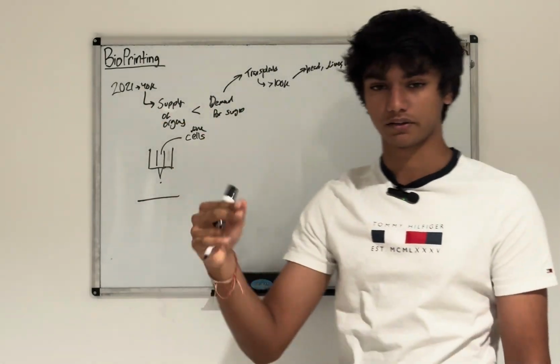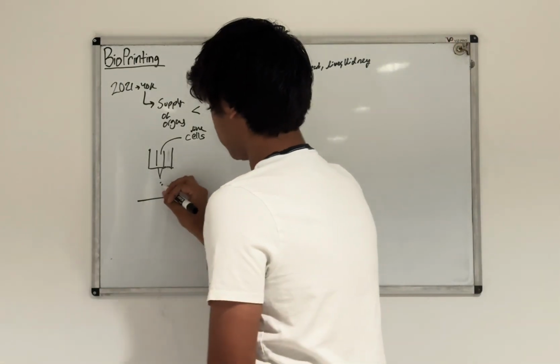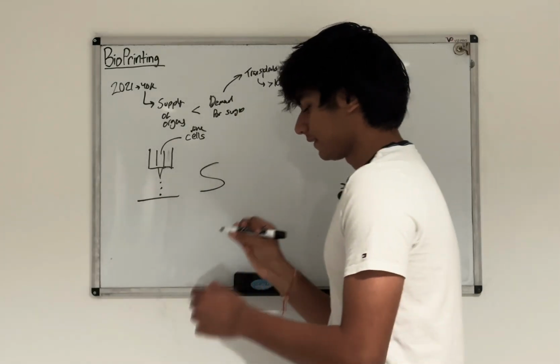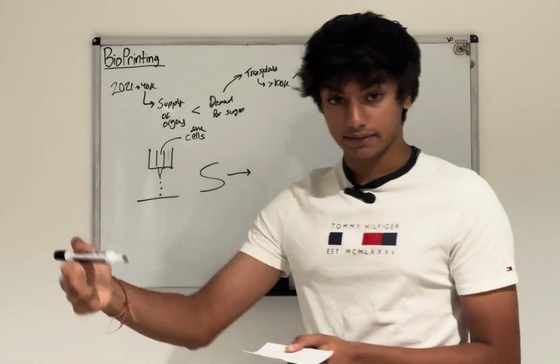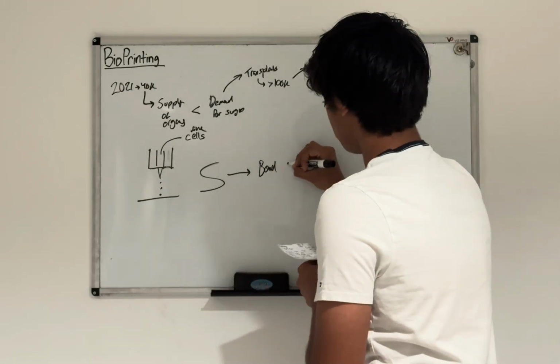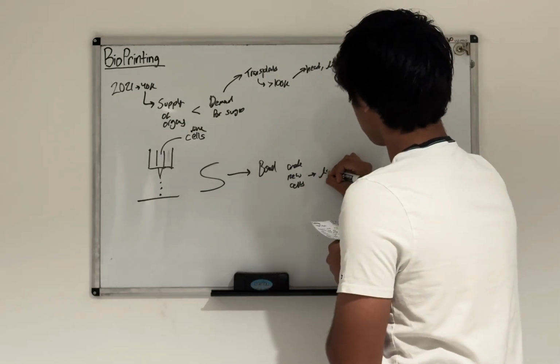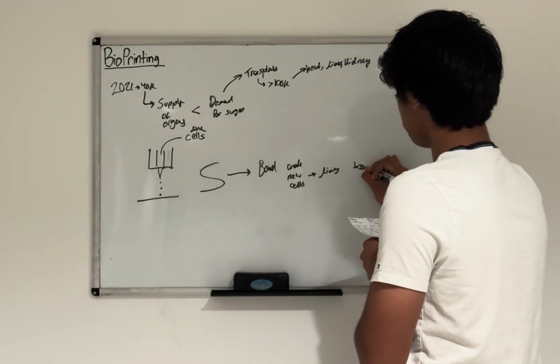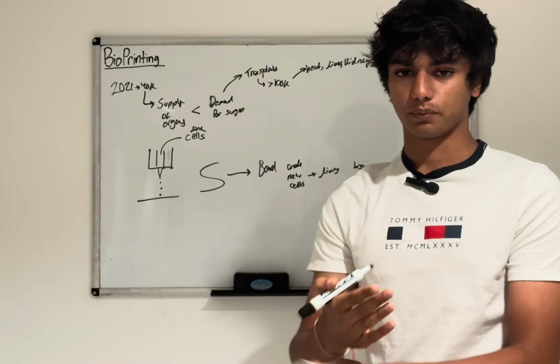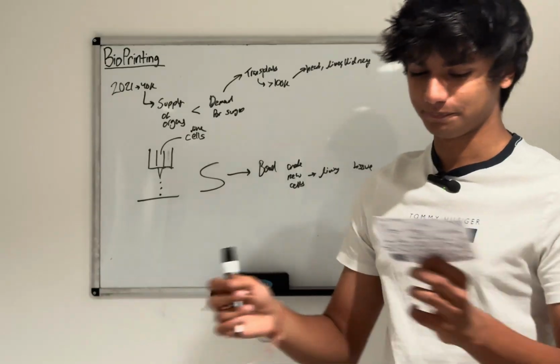How the inkjet printer works is it sends blobs of ink on a platform. They sent these blobs and made a basic little structure. Then these cells did what they naturally do. They were able to bond, mutate, and create new cells, and eventually this created living tissue. So this first type of bioprinting worked by sending blobs of live cells, and eventually these cells would do what cells normally do, combine, create new cells, and become tissue.